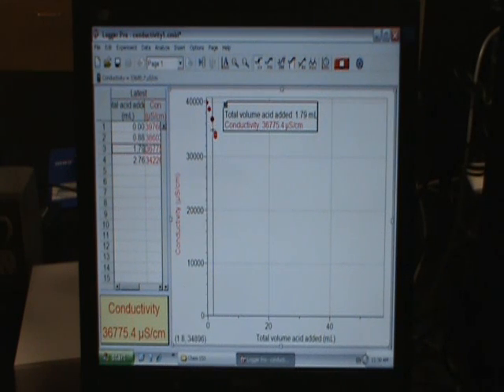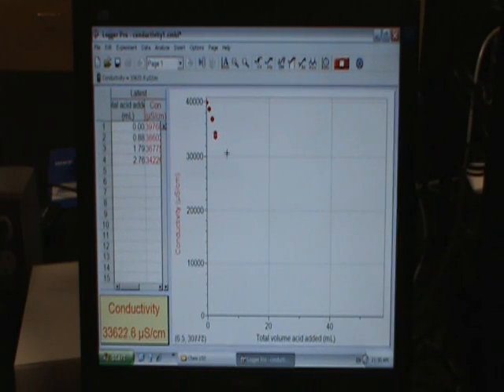It's telling me for this data point that's highlighted with a black circle, the total volume of acid added is 1.79 milliliters. The conductivity is 36,000 and change. So, that can be useful for some things. We can get rid of that just by closing that dialog box.